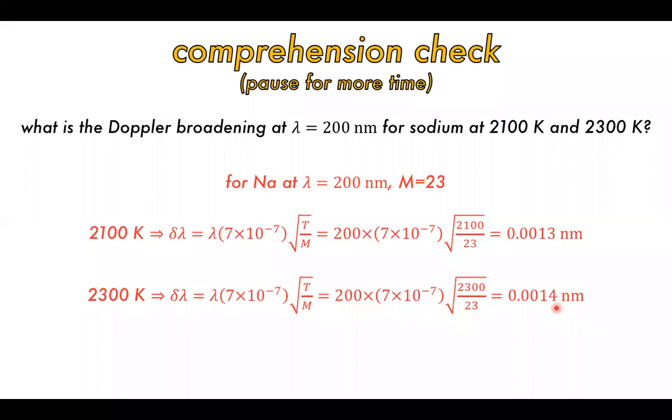There is an issue then with emission spectroscopy where you might have a lot of lines overlapping with each other because you have a lot of different elements. This could make it difficult to find the elements if you're at too high a temperature, because what can end up happening is you get too much broadening. Although if it's a really heavy element, the Doppler broadening has less of an effect. Why is that? Because the mass gets larger, so this overall number gets smaller. So that makes everything else smaller.